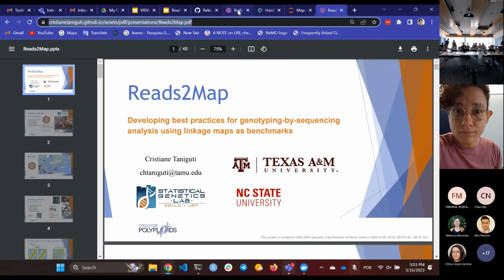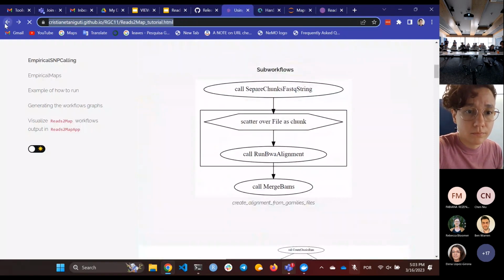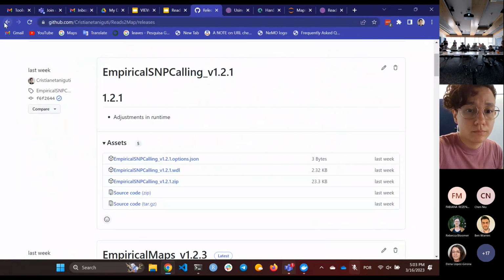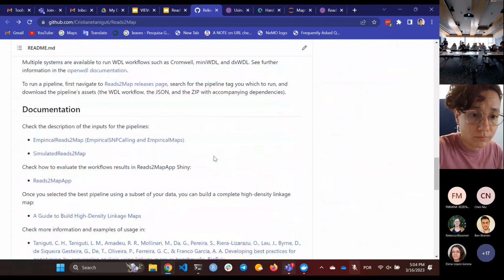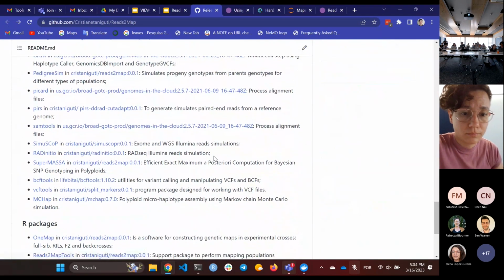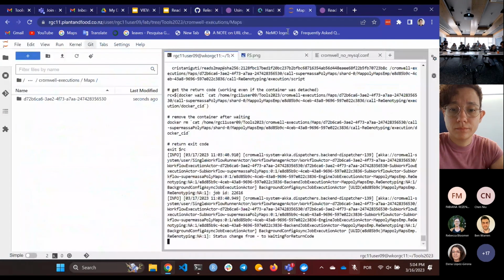Just remove it. By default you don't want to do that. So do you want to? We have the chunk. Yeah, sure. Okay, let's do it. I think it's just taking a long time. Okay, it's going.